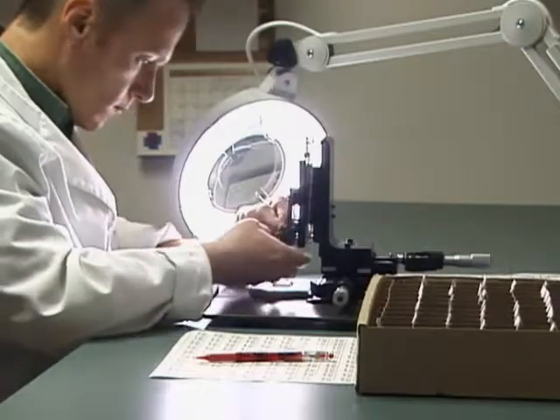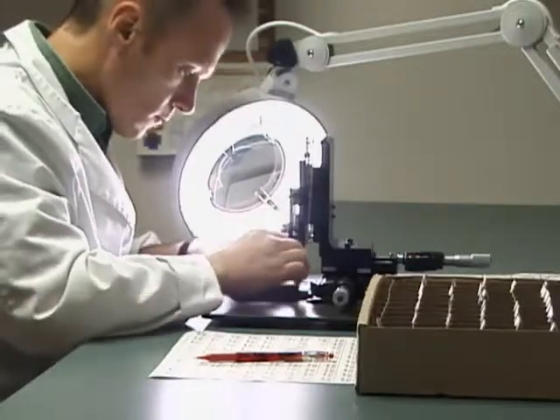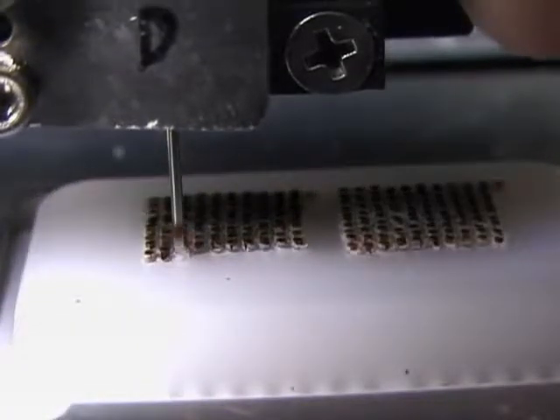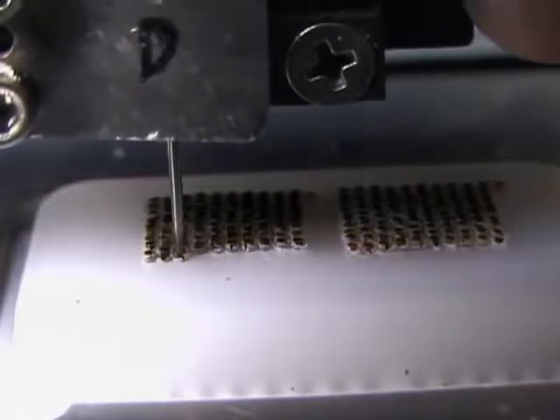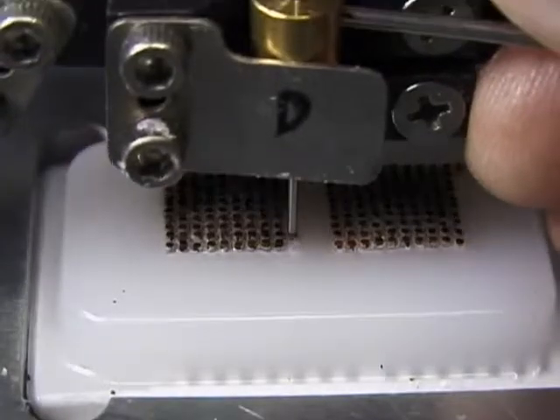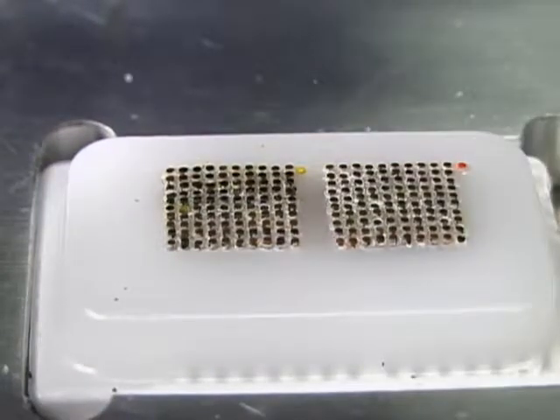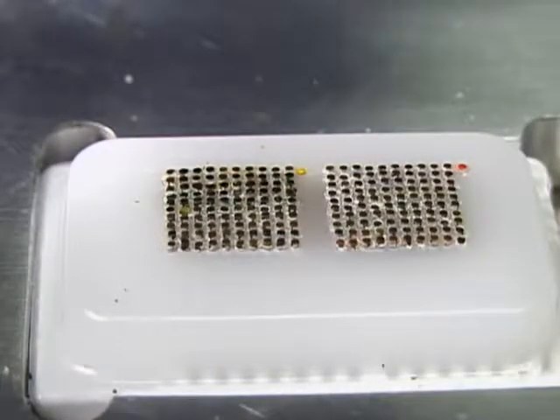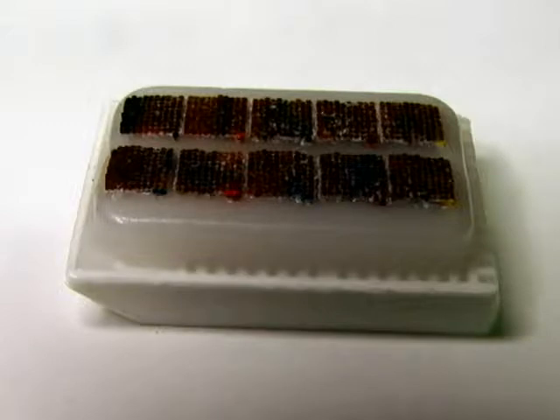I use plastic slide boxes to dispose of paraffin cores. This keeps from having paraffin scattered around my work area. It is also easier than reaching for a trash can after every punch. This is a block with 1,000 specimens at 0.6 millimeter apart. Note the colored location markers.